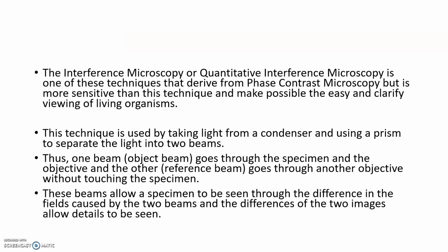Interference microscopy, or quantitative interference microscopy, is one of those techniques, and it has been derived from phase contrast microscopy, but it is more sensitive than that technique and makes possible easy and clear viewing of living organisms. Now how does this technique work?